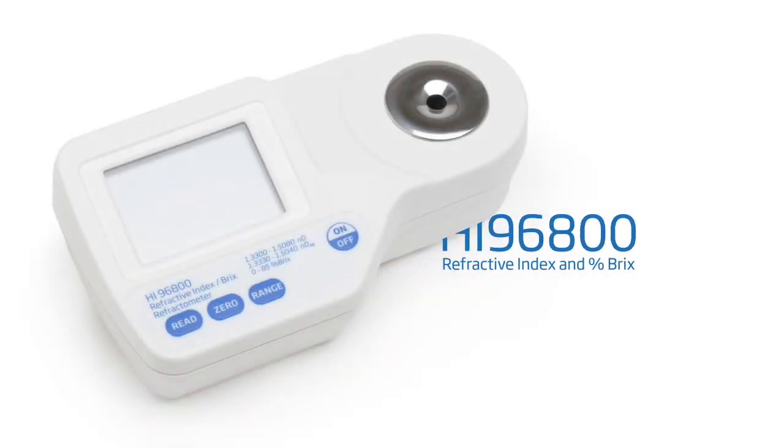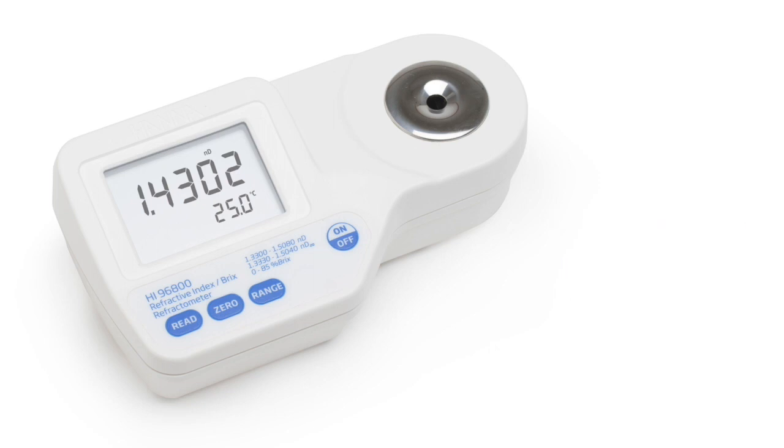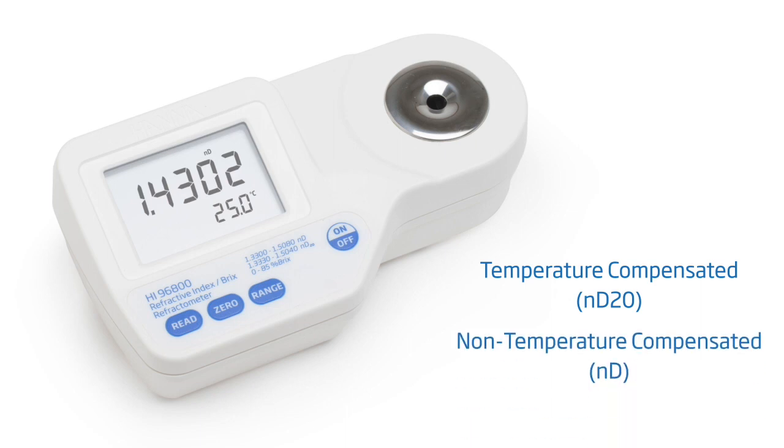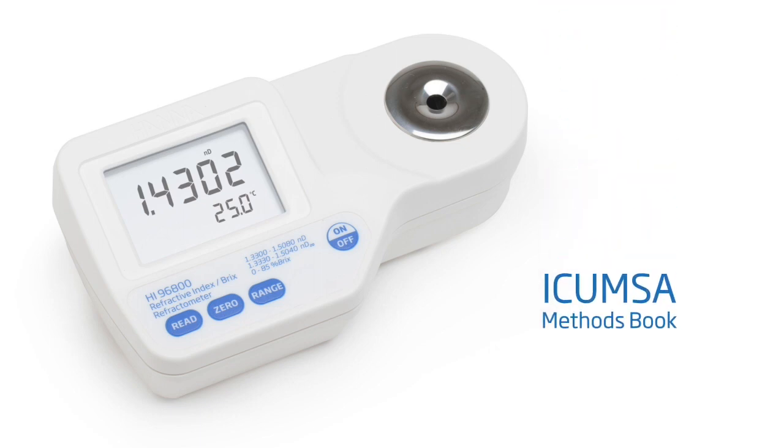The HI-96800 is a digital refractometer for the measurement of refractive index and percent brix in aqueous solutions. The refractive index of a sample can be displayed in both temperature compensated or non-temperature compensated formats. The temperature compensated readings are based on temperature algorithms in accordance with the ICUMSA methods book for a percent-by-weight sucrose solution at 20 degrees Celsius.